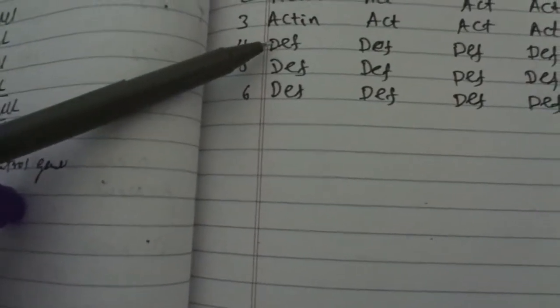And here the second gene, the gene that is differentially expressed in our sample according to the sequencing result, the defensin gene. The defensin gene is replicated for the RC samples 3 times.